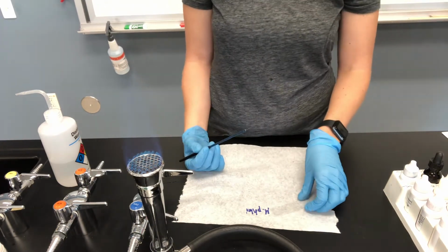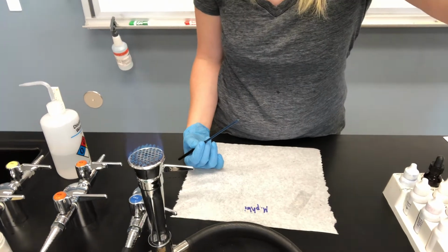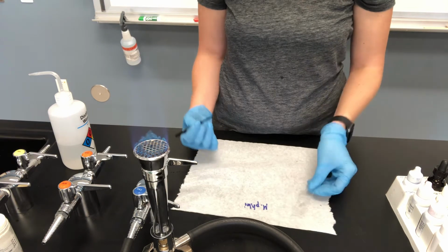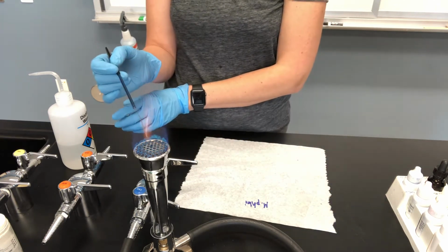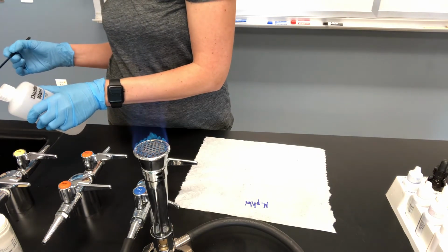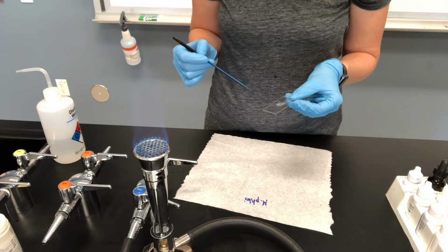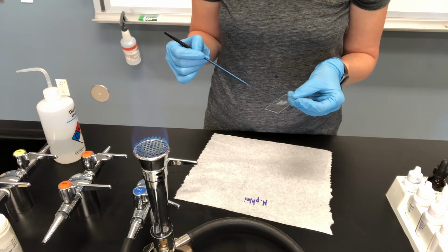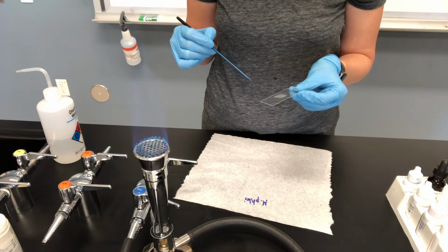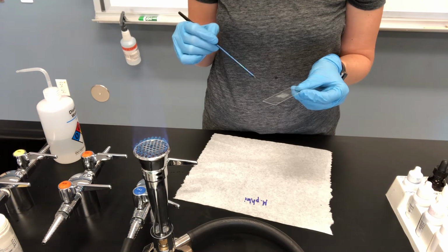Sometimes if you find that you did too much water or too much bacteria, you can always adjust it. I got a little bit too much bacteria, so I might go back and add a tiny little bit of water just so my smear isn't too thick. If you add too much water, you can always make your smear bigger on the slide so it spreads out, and then it will dry a lot faster instead of a big concentrated puddle right in the middle.